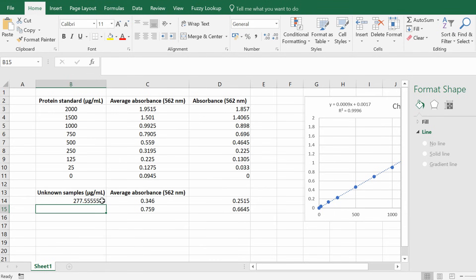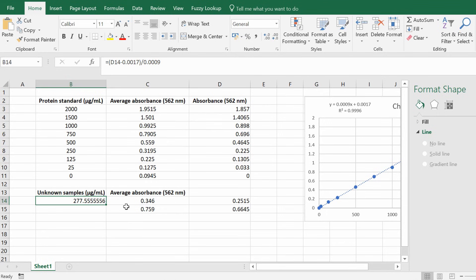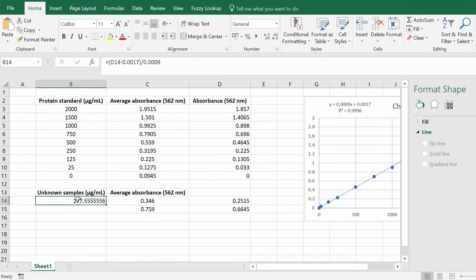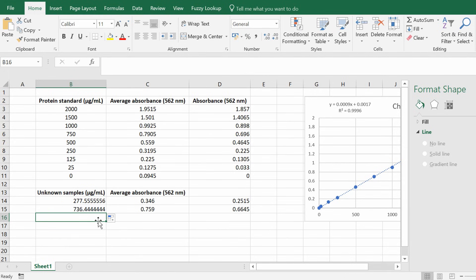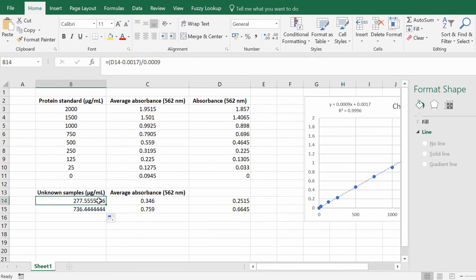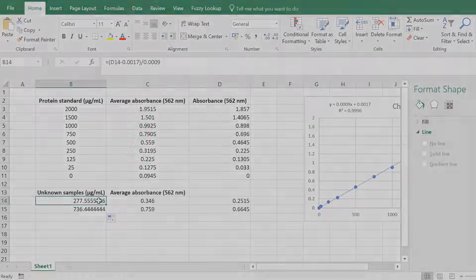So this is the concentration in micrograms per milliliter for this first sample which equals 277 micrograms per milliliter. If I wanted to repeat the same thing for the second sample, all I have to do is click on this cell and then drag it down. So you can see that that second sample actually has got more concentration than the first sample. So that is how you can create a linear standard curve by using Microsoft Excel and calculating unknown concentrations by using that curve.